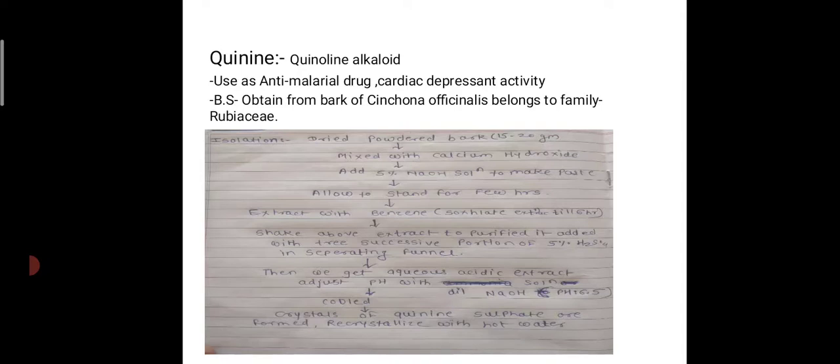After this, we get the aqueous acidic extract. Then adjust the pH with dilute NaOH; the pH is adjusted to 6.5. After that, cool the solution. We get the crystals of quinine sulfate, and to get the crystals in purified form, we go for recrystallization, which is done with hot water.